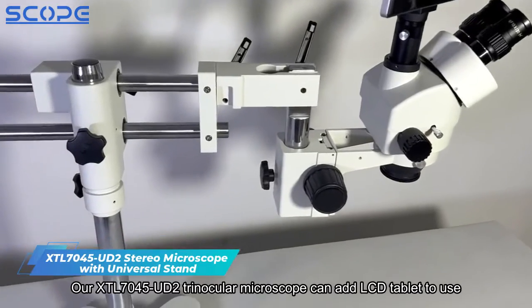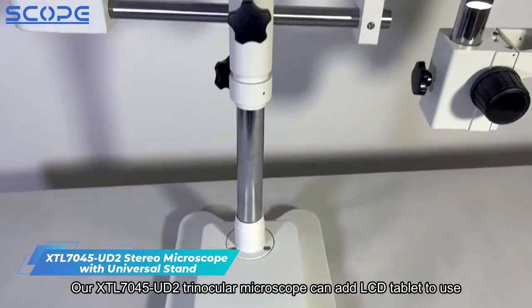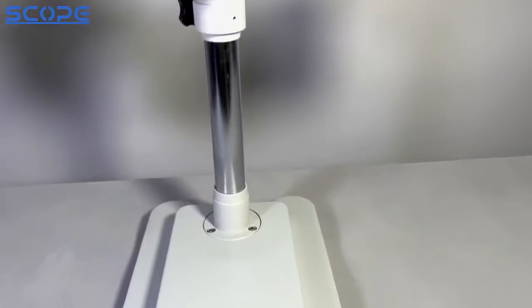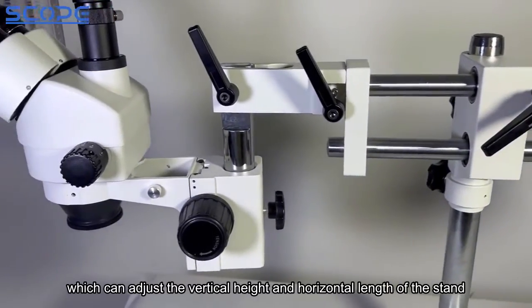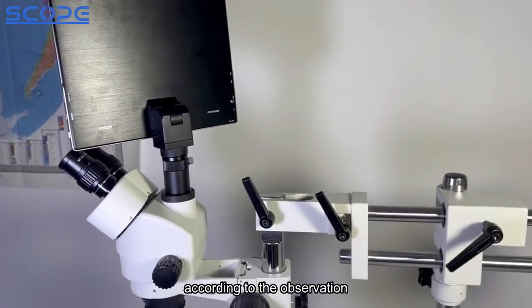Our XTL7045U-D2 Trinocular Microscope can add an LCD tablet to use. On the other side, various adjustment knobs are installed, which can adjust the vertical height and horizontal length of the stand according to the observation.